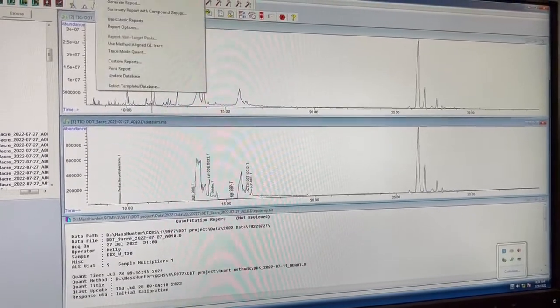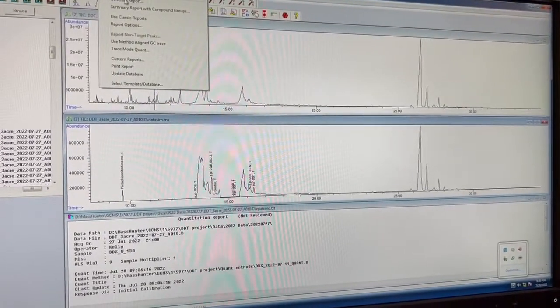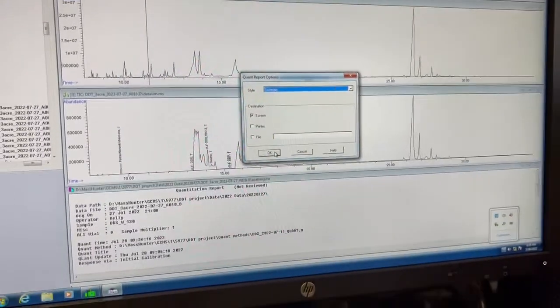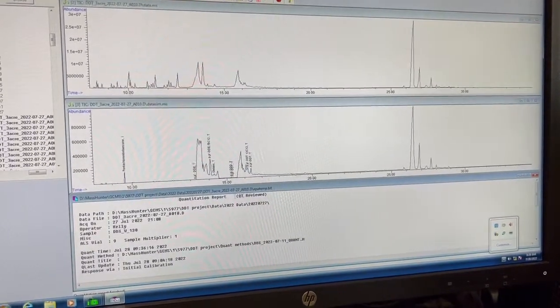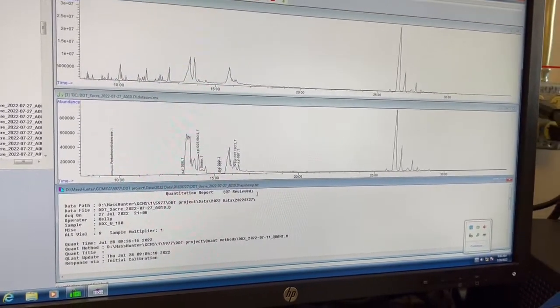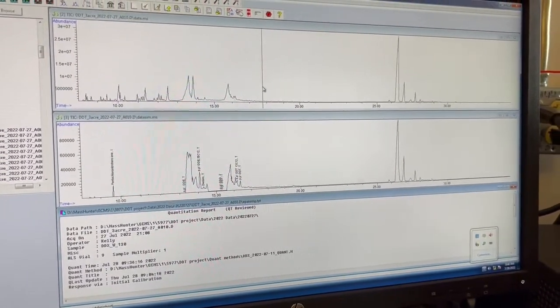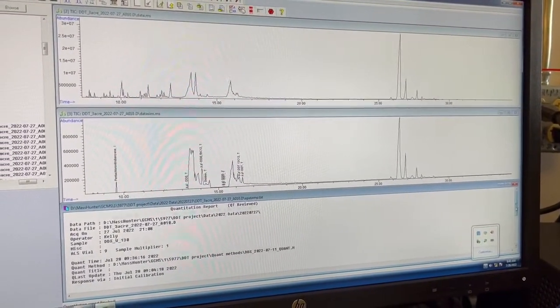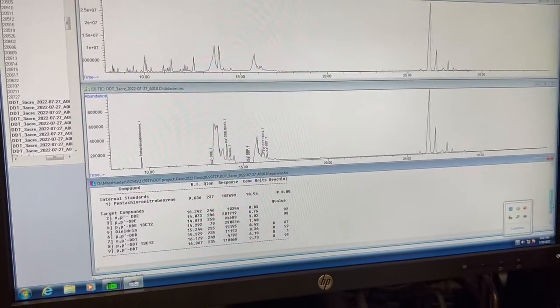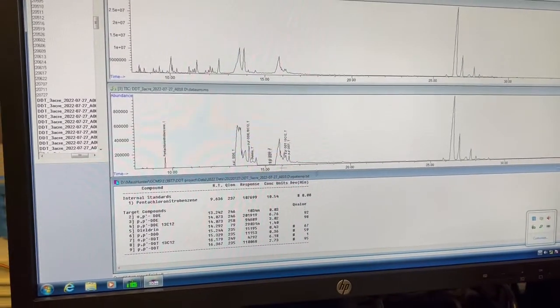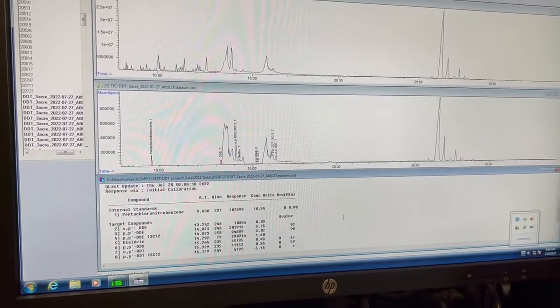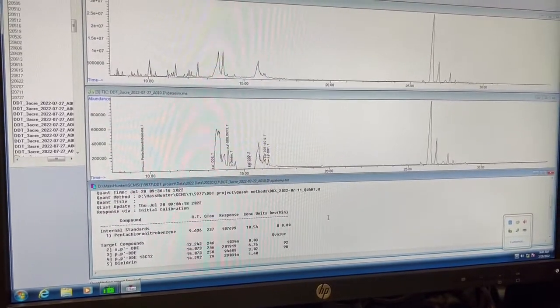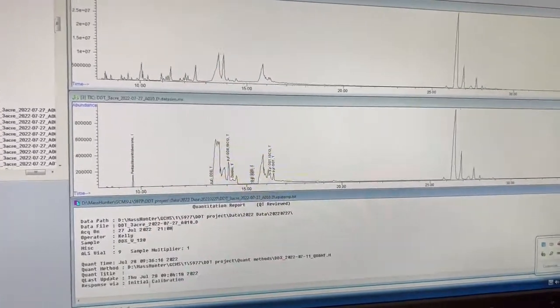And then we want to see our results on the screen, so we hit Generate Report. Summary. And you can see this changes to saying QT Reviewed. So that just means that you went through the QEdit and you made sure it looked good. And you can again see our results down here. You don't need to look at these every time. It gets a little time consuming. That's how we do our samples.